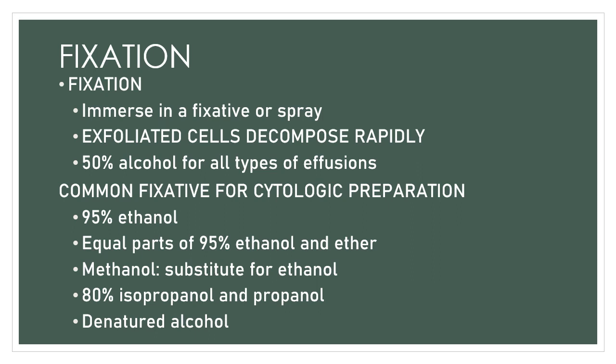But then, due to its hazard, it is flammable, volatile, and of course it poses fire hazards, then this one is not commonly used by laboratories, no? And so the most commonly used is your 95% ethanol.